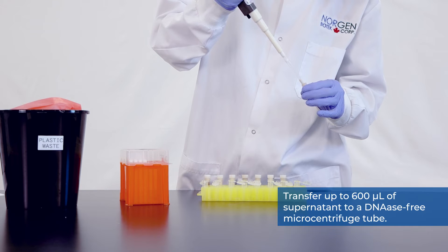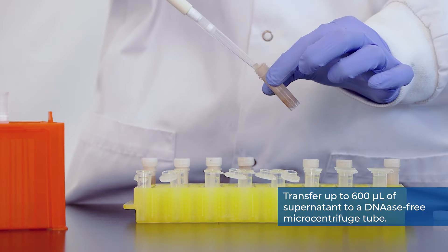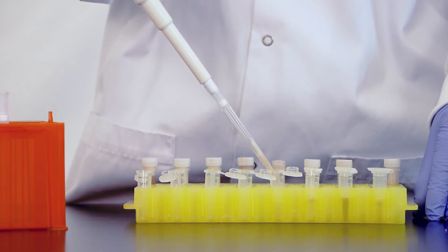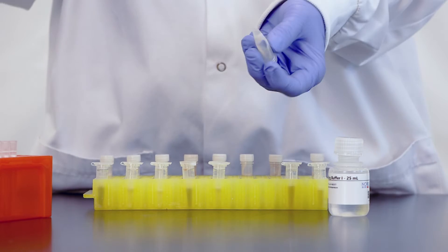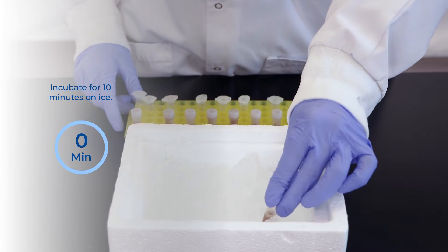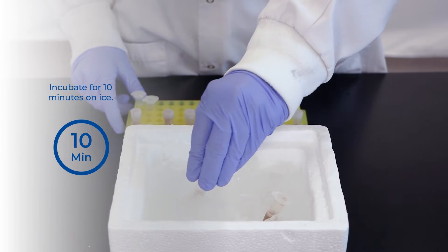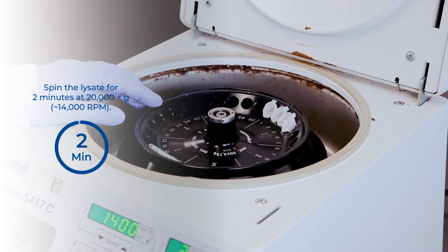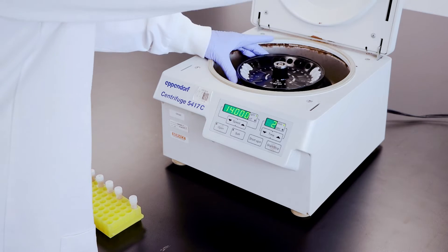Transfer up to 600 microliters of supernatant to a DNase-free microcentrifuge tube. Add 100 microliters of binding buffer I and mix by inverting the tube a few times. Incubate for 10 minutes on ice. Then spin the lysate for two minutes at 20,000 G or 14,000 RPM to pellet any cell debris.